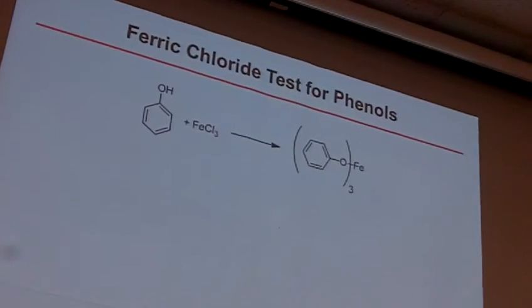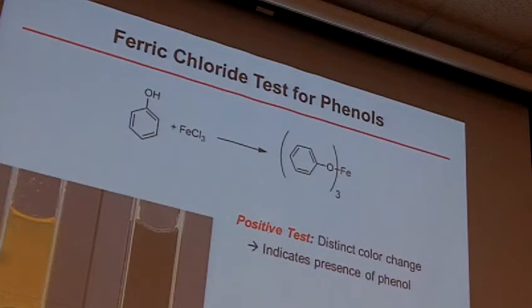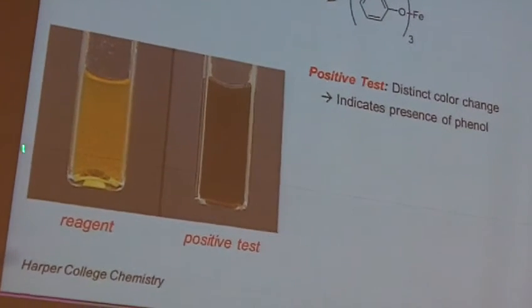What that looks like, this one's really simple in terms of the actual chemical reaction, is you simply take a phenol. We haven't discussed this in lecture yet. A phenol is an alcohol that's directly connected to an aromatic ring. You see the oxygen is directly connected. There's no other atoms in between. So it is a type of alcohol, but it's a very specific type of alcohol. That phenol is reacted with a ferric chloride solution. Ultimately, we make this new iron complex, and there's a change in color. What's interesting here is we see a distinct change in color. This one's going to be kind of a yellowish solution. This is to start.